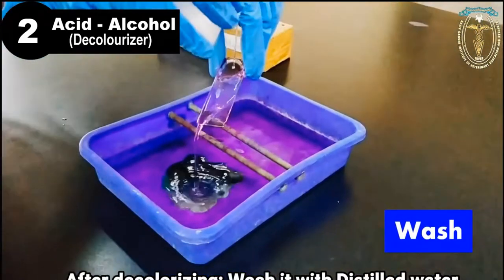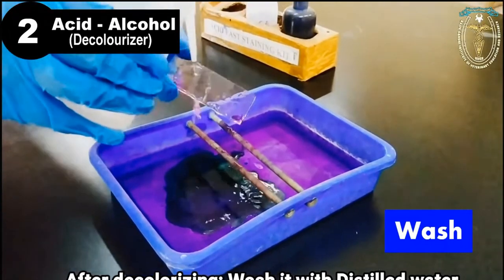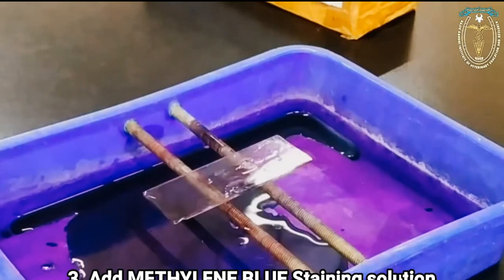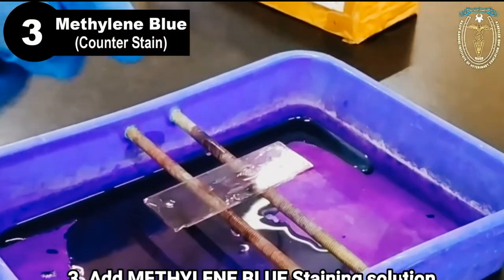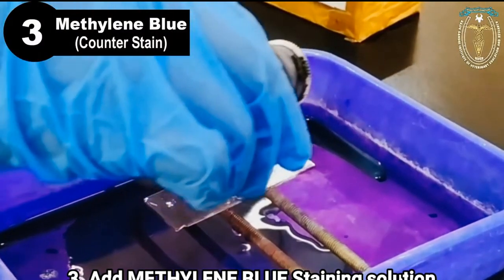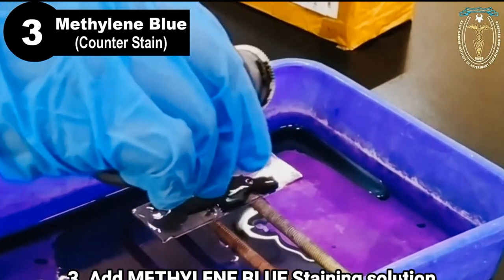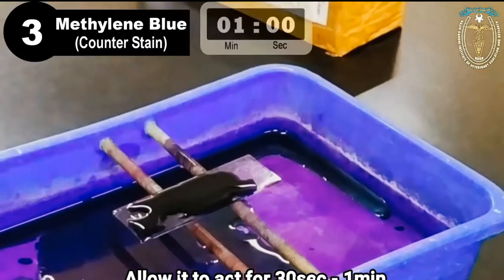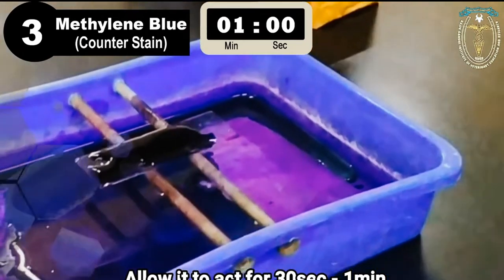Lastly, add the Loeffler's methylene blue staining solution over the smear. Cover the entire smear with the staining solution, and allow it to stand for 30 seconds to 1 minute. After 30 seconds to 1 minute, wash it with the distilled water.